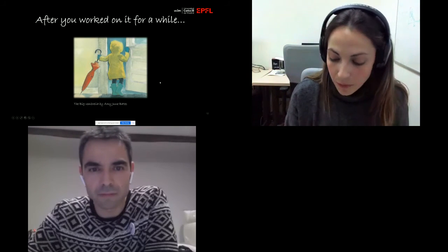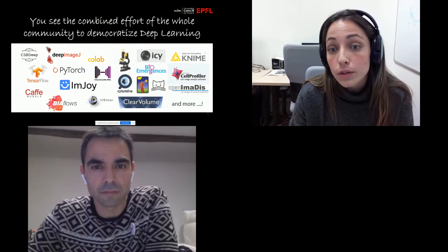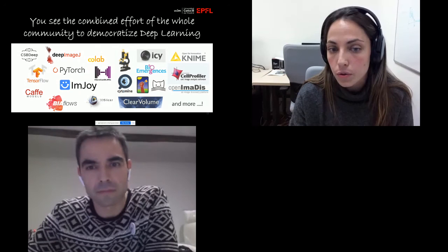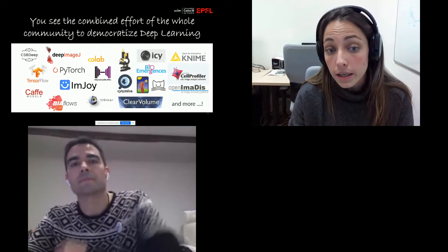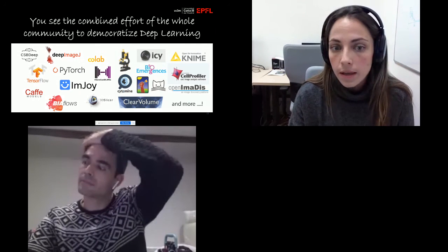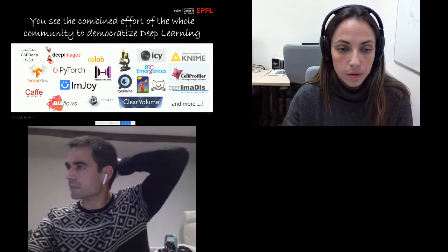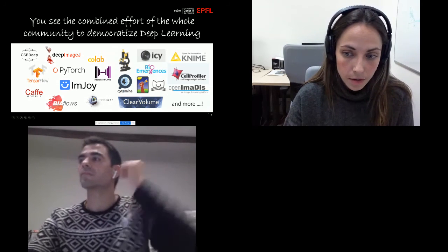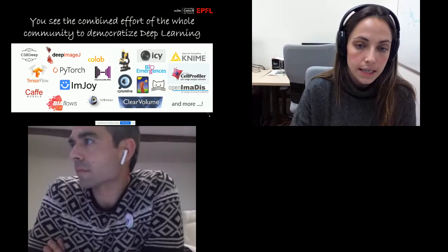So what happened when we started working on DeepImageJ is that after just some time, we see that there was really a huge effort from the whole community to democratize deep learning. So to just show how should we use these models and how we should speak about them or interpret them, or how to do the validation or all these kind of things. You can see here all the open softwares that are really involved in this democratization.